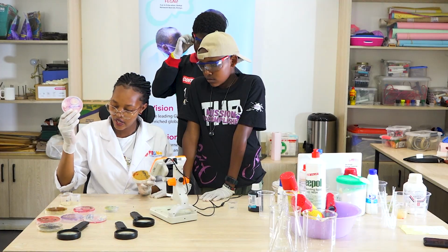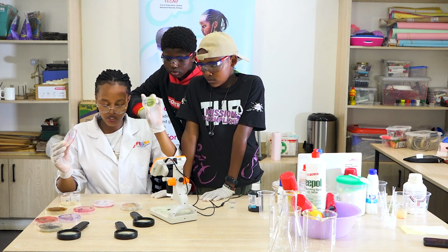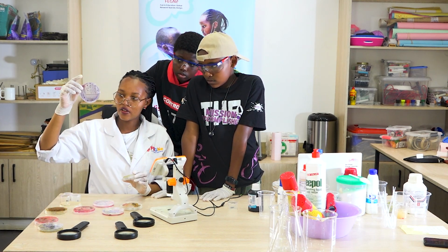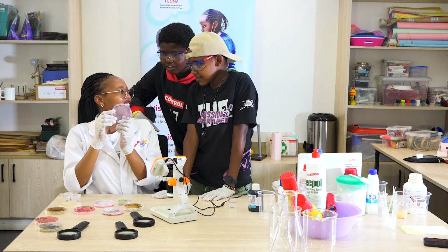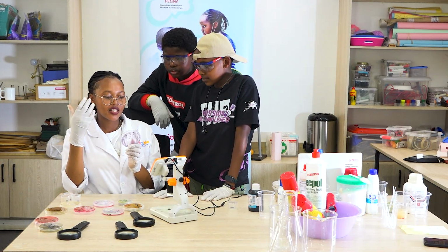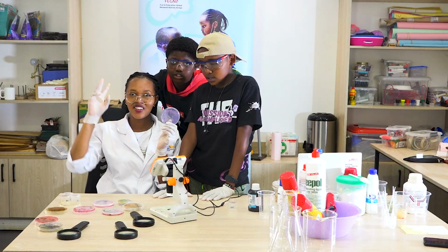You have fusarium, trichoderma over here, and you also have penicillium, which is an antibiotic, and we also have some bacteria here. So we'll observe the colonies. The colonies is how they exist. If I am a bacteria, I myself am one colony. Together we are a colony of bacteria.